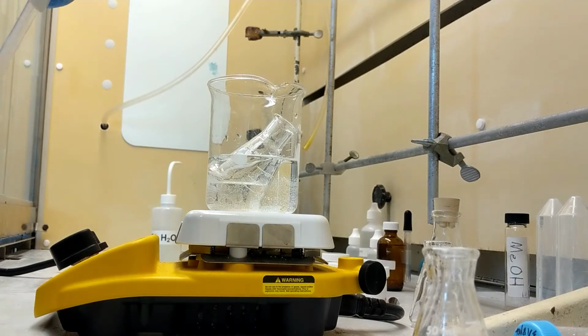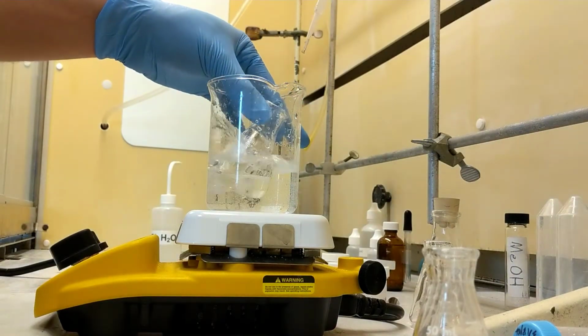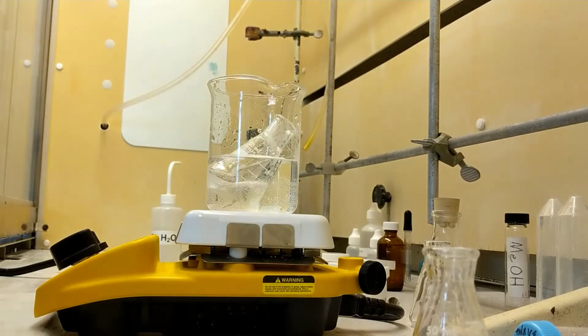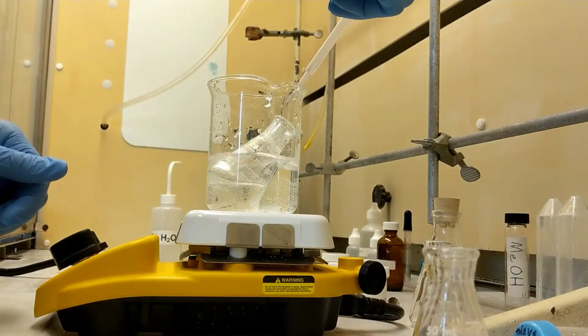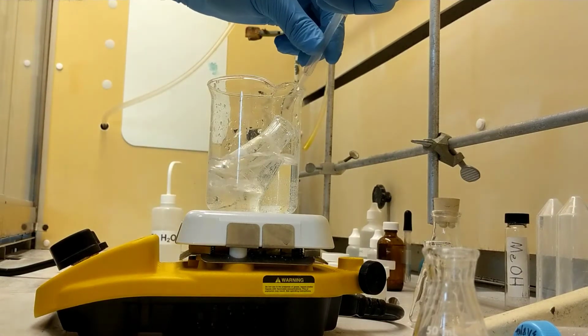I mean, evaporate off all the methylene chloride. Maybe a little less power. So I'll just work like this until it all evaporates off, and I'll come back to you guys then.